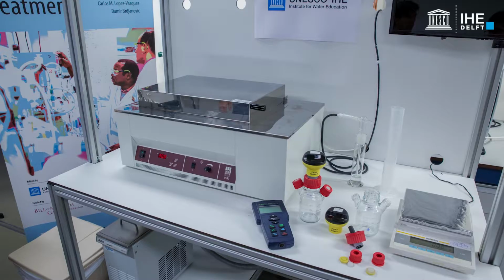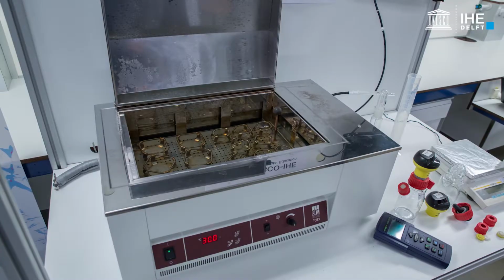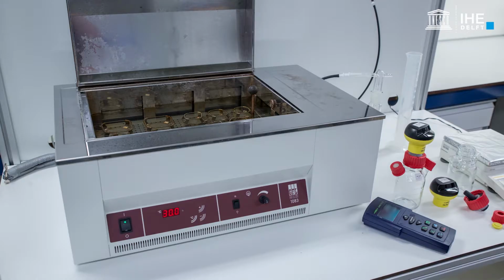The reactor needs to be placed in an incubator that limits the temperature oscillations to plus or minus 0.2 degrees centigrade. Finally, a magnetic mixer or an orbital shaker is needed in order to ensure that the reactor remains well mixed during the batch test.